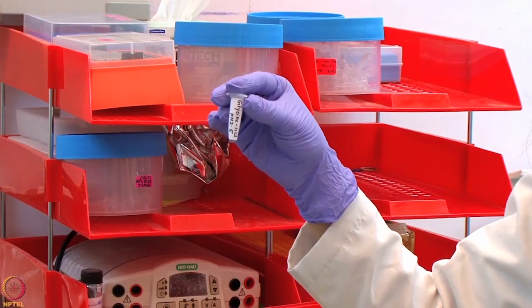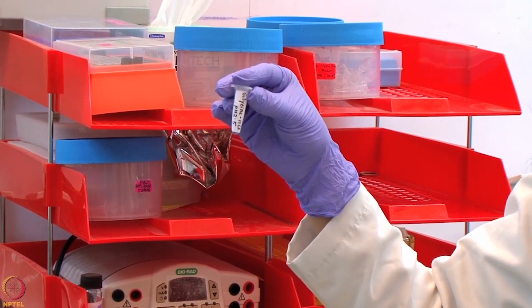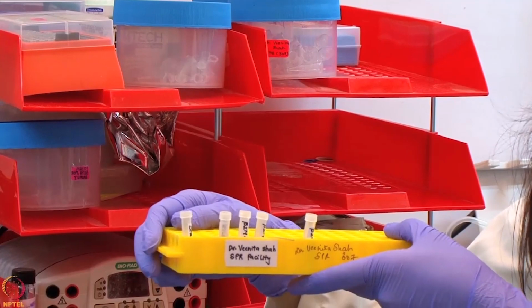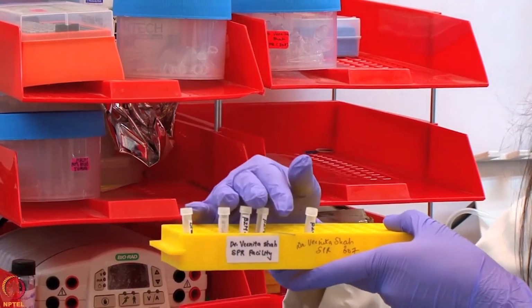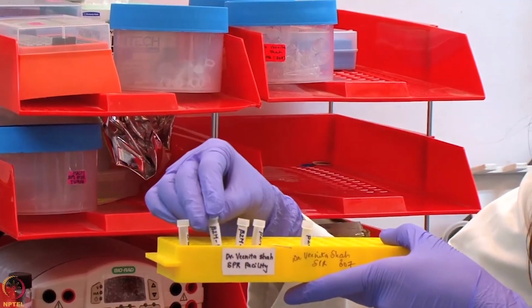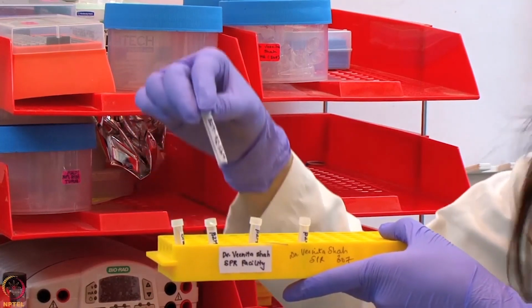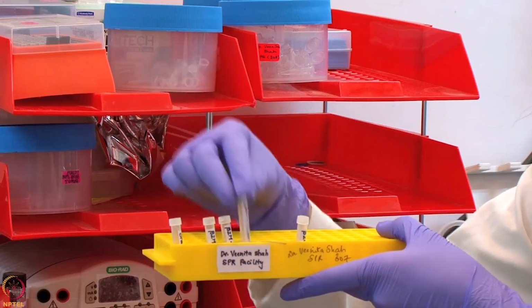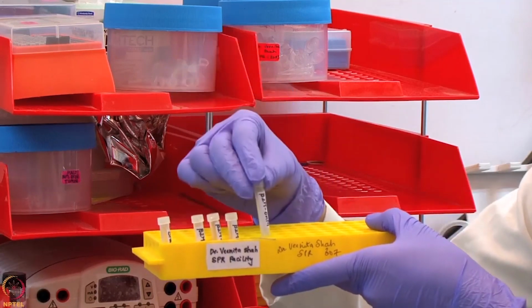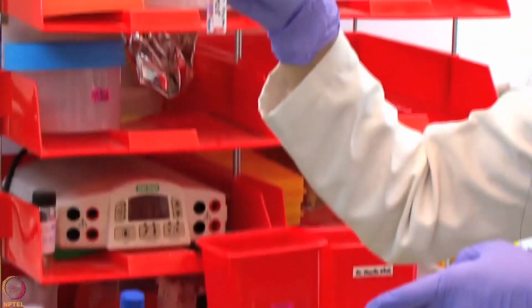For the regeneration of the surface, we have prepared glycine HCl pH 2.5 as the regeneration solution. We have transferred all the solutions in the specialized tube starting from the startup, beta 2M concentrations starting from 85 nanomolar, 42.5 nanomolar, 8.5 nanomolar and 0 nanomolar. The regeneration solution is placed in this glass vial.